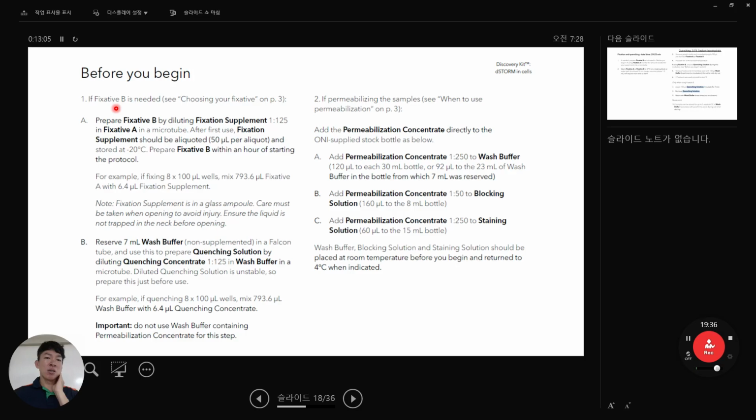And then microscope setup. The microscope setup is similar to confocal, but very simple. Turn on the nano imager. The thing is that you have to turn on the machine 1 hour before to increase temperature up to 32 degree. This is the only thing different.